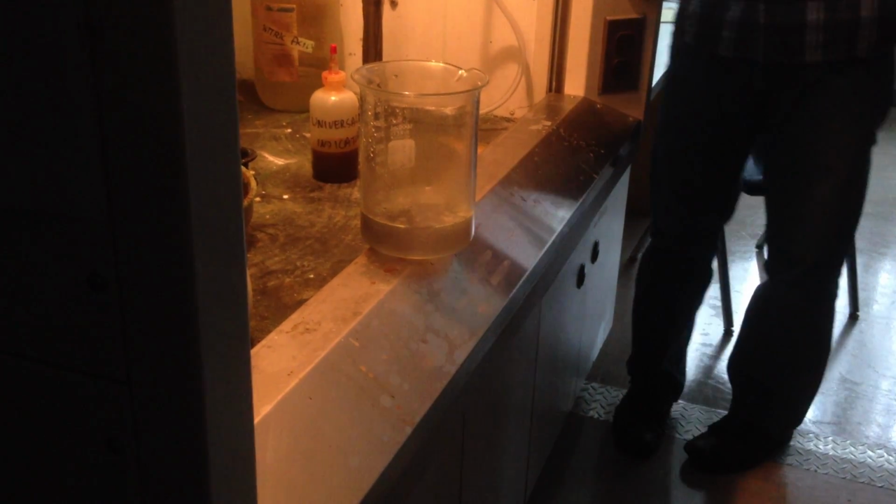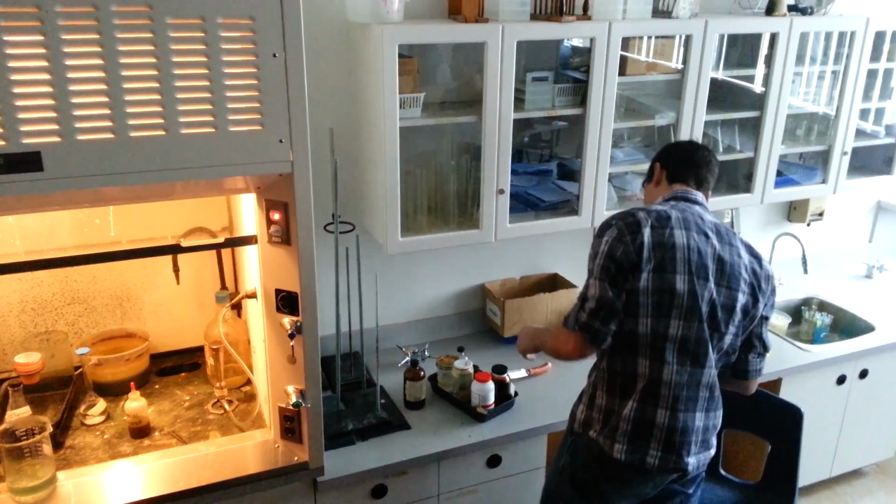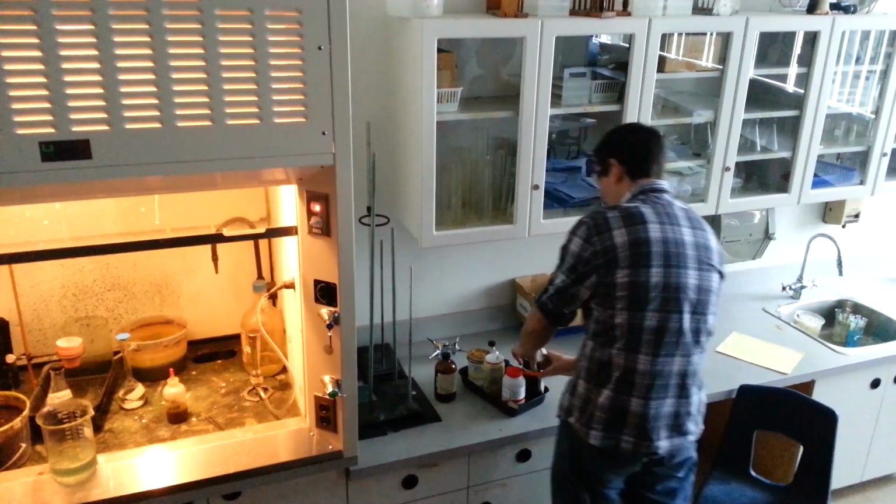And so, we seem to have established a bit of a trend. Going down the column, it seems to get more violent. Now, after seeing 2 examples, can you be sure it's a trend? No. We need to see it in the pattern. Francium! Yeah.